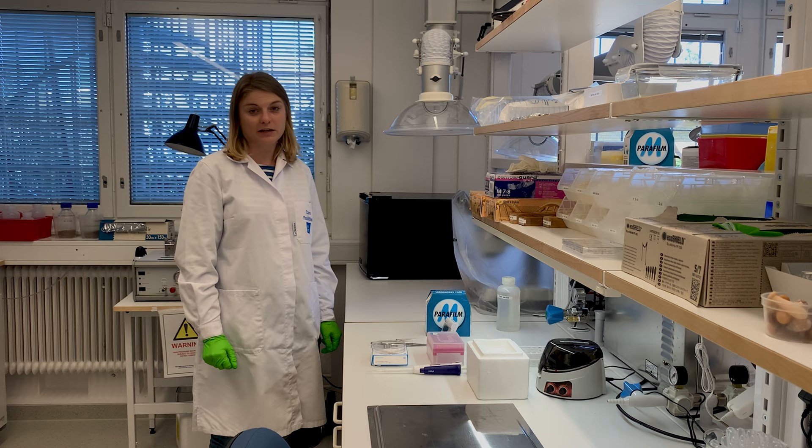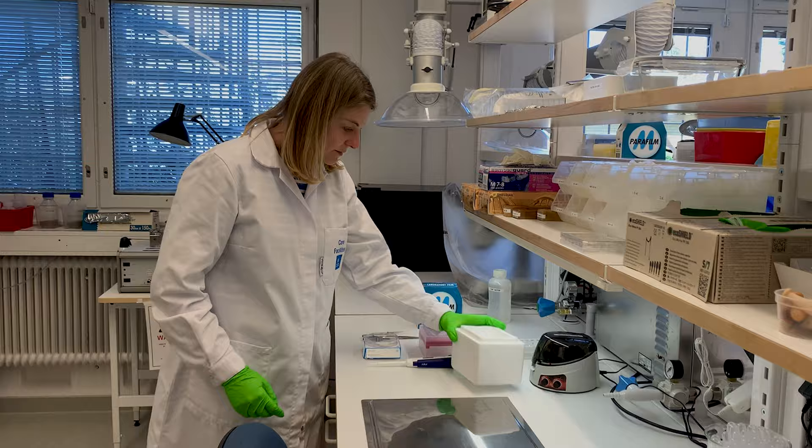Hi, my name is Anna and let's have a look together at our basic negative staining protocol for screening particulate samples.